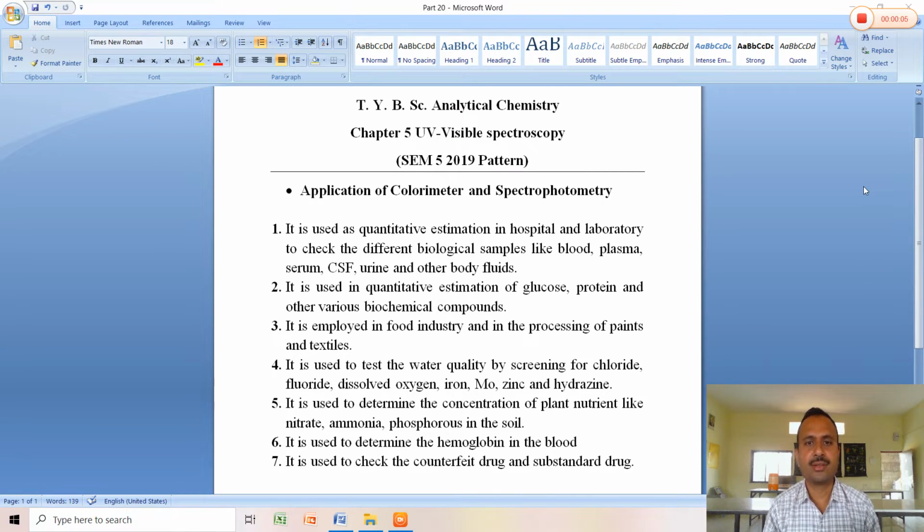Good afternoon, friends. Now, this is a series of lectures associated with the visible spectroscopy chapter. The chapter is credit-based 2019 pattern TYBSc Analytical Chemistry. Now, in the last lecture, we have taken some applications associated with colorimeter and spectrophotometry. In the same, here we are going to learn applications of colorimeter and spectrophotometry.